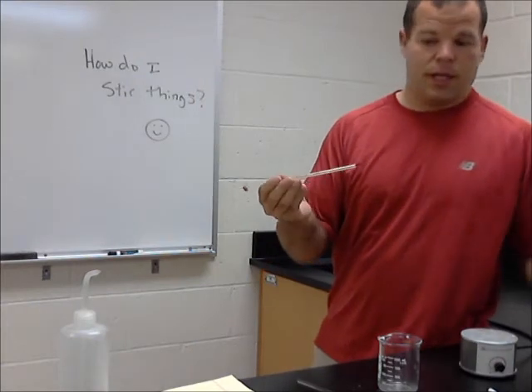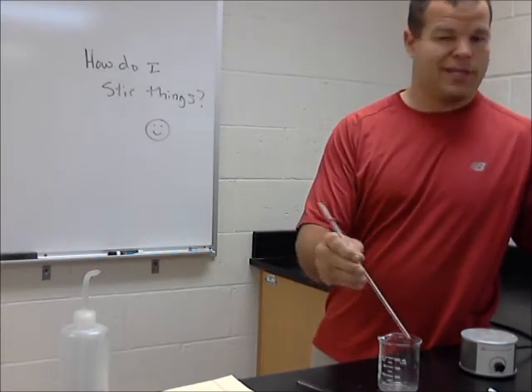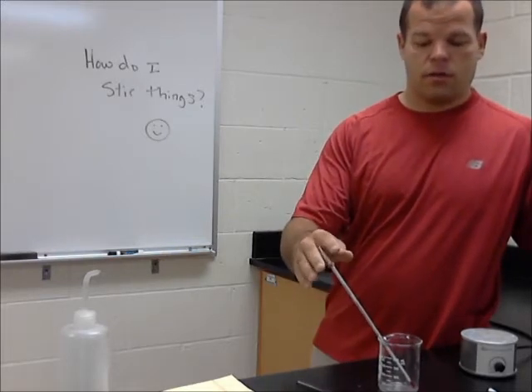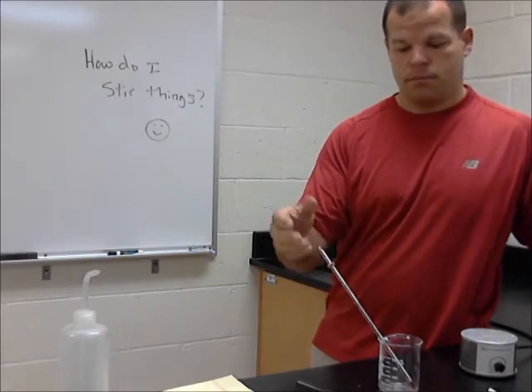Another common thing we might use to stir something would be a thermometer. We could stir with it potentially — not against the rules, go ahead. But again, left in there, or even just left to measure the temperature, can cause a tipping problem.